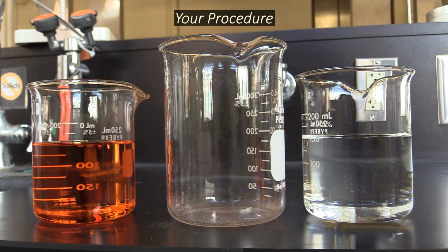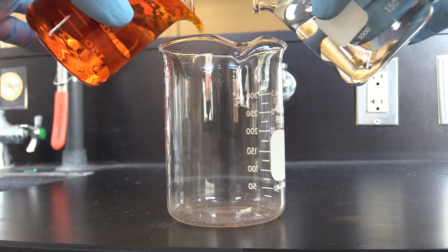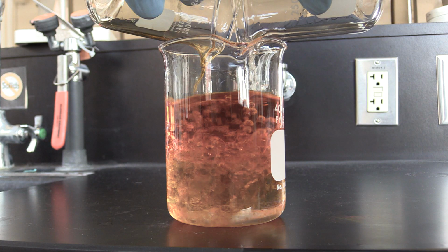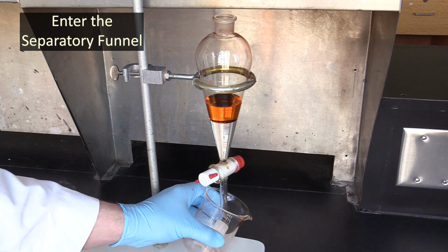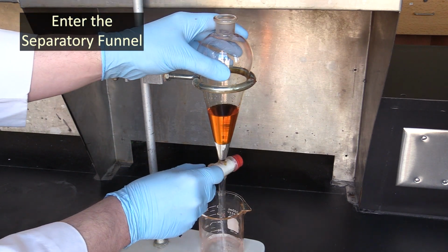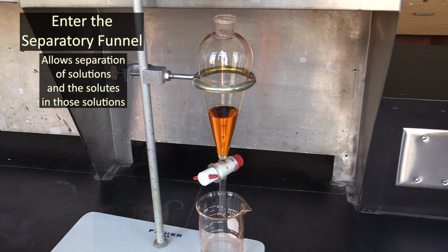Now let's go over your procedure. As you may have guessed, a big part of this is going to involve mixing aqueous and organic solvents together. However, you're not going to do this in just any old container. Instead, you're going to mix them in one of these here pieces of glassware, a separatory funnel. These funnels have a valve at the bottom you can use to drain off the lower layer and leave the upper one behind. This will let you separate the two layers as well as any solutes that are dissolved in them.